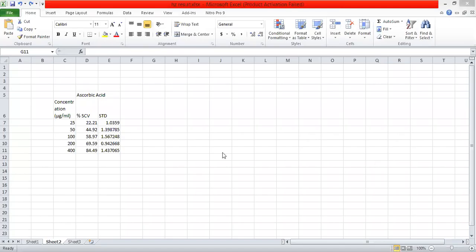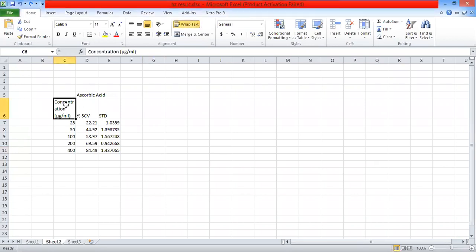Asalaamu Alaikum. We will see how the Excel sheet is used. We will see IC 50% inhibition. We will see the visual inspection. We will see the parameters. We will see the graph.